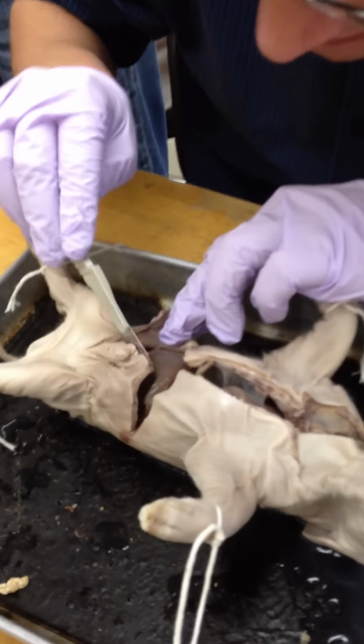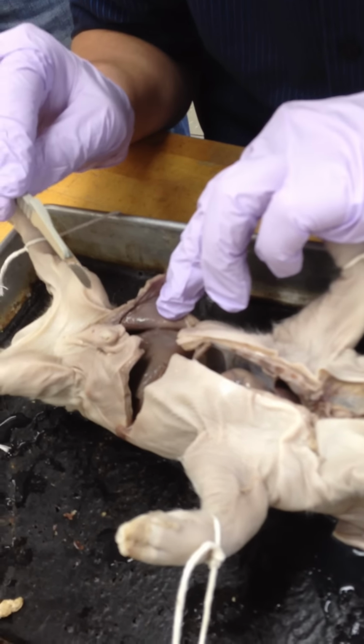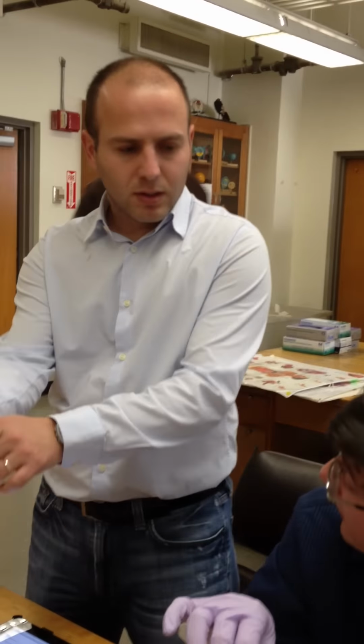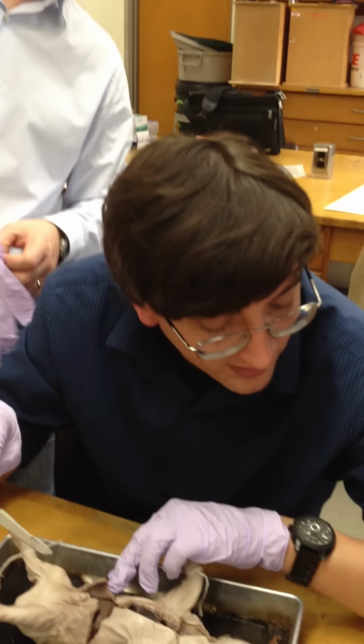The umbilical cord runs basically through the liver, as I recall. Yes, one part of the liver is like the remnant of the umbilical cord, isn't it? Because incoming nutrients have to go through the liver first. Right, yeah. I made a lot of progress with that, but I'll come onto them anyway.